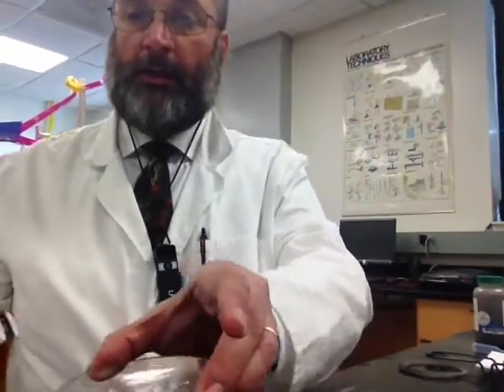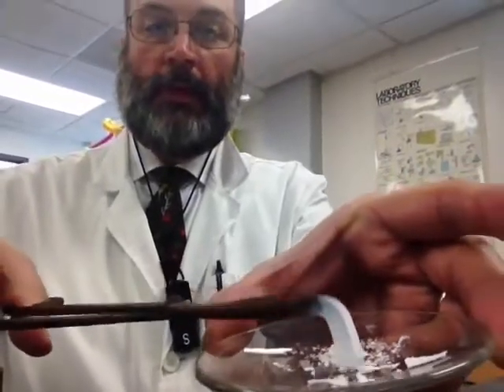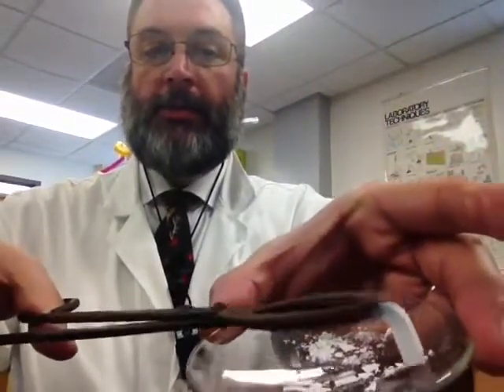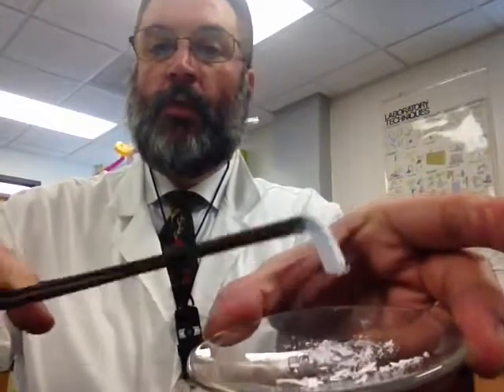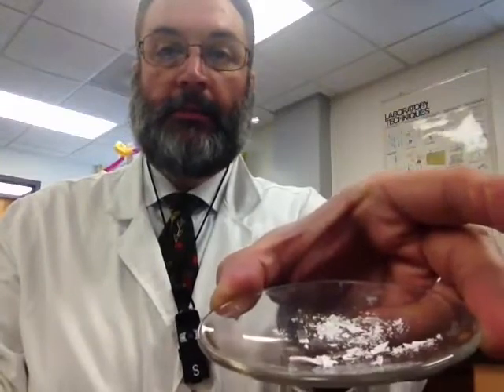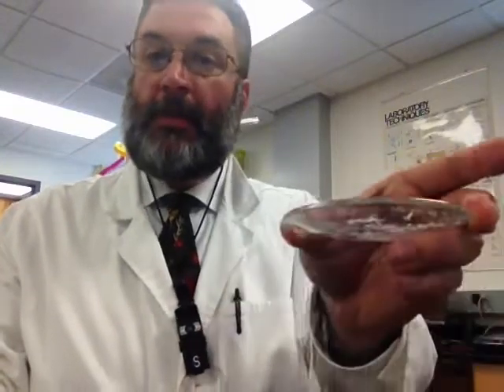Okay? Pretty neat, huh? Now, I want to show you what it looks like now. So, if you look, it's now no longer a gray piece of metal. It's now this crumbly white solid stuff sitting in there. Okay? So that's magnesium metal being burned, and we know that when we burn something, that has some implications as to what's involved with that. Okay? I can do something else with a little piece of magnesium.